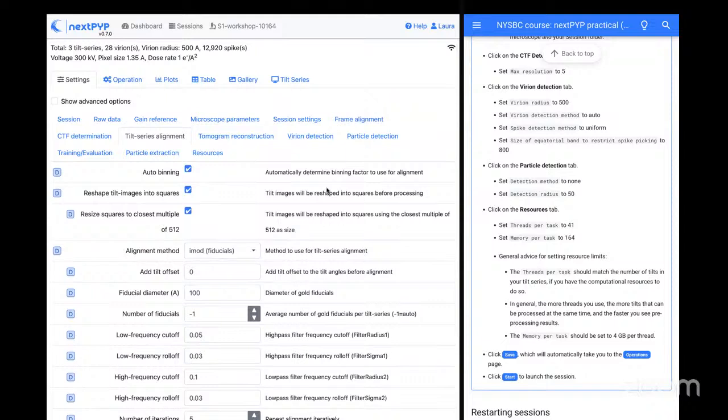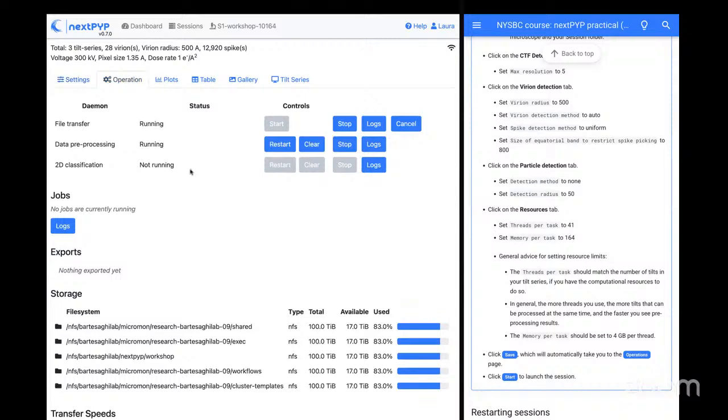So building off that, say you reprocess 3D tomograms and realize you need to change some of these settings, how would you apply that? It's almost like I planted your question. That's what I'm going to do next.